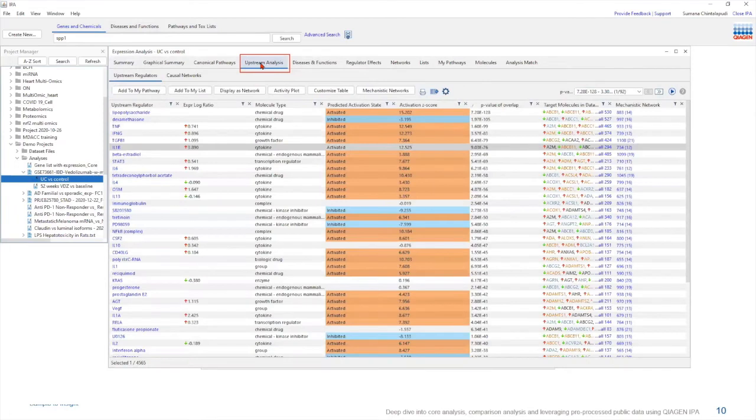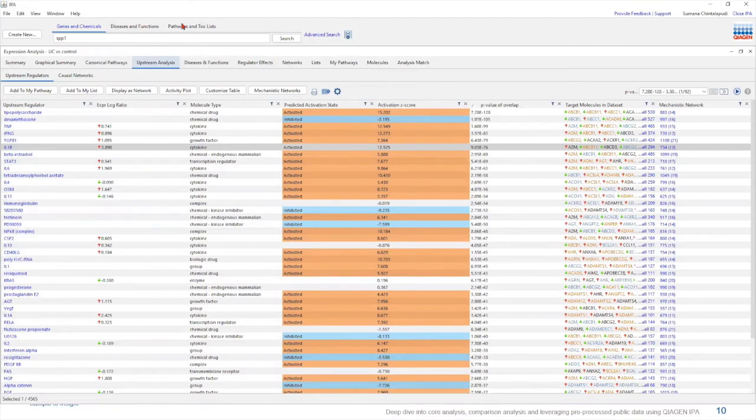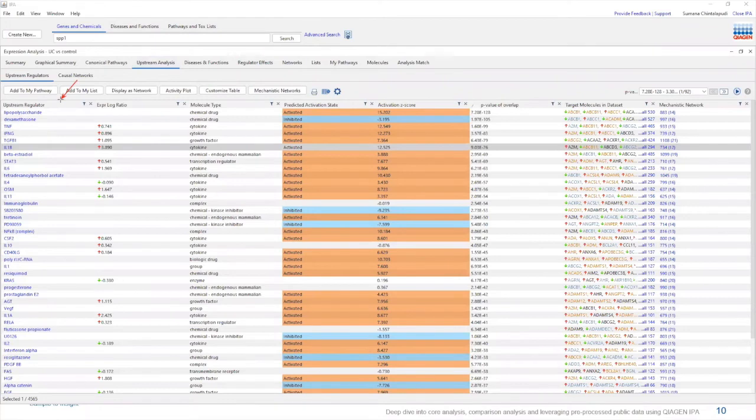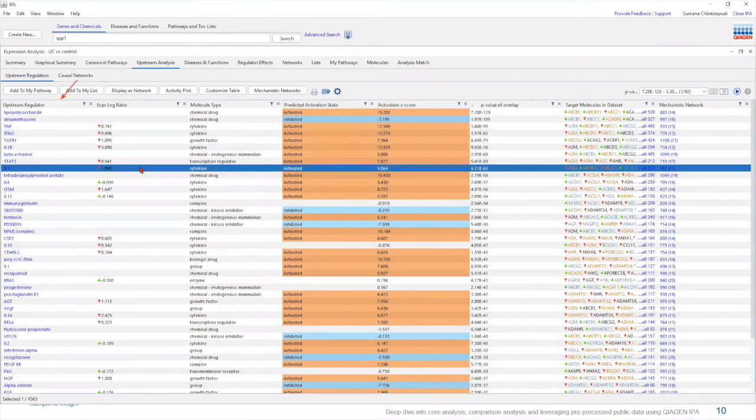Now under this tab, this table lists the information about individual upstream regulators that affect the genes within your data set. The first column over here contains the name of the upstream regulator. And this table is arranged in such a way that each upstream regulator has its own row.